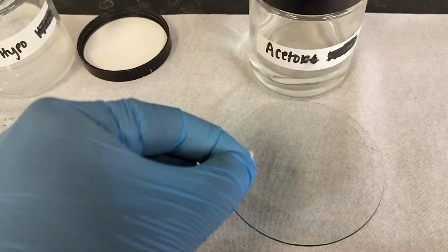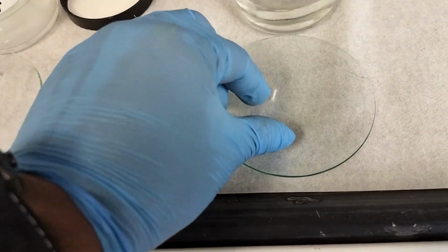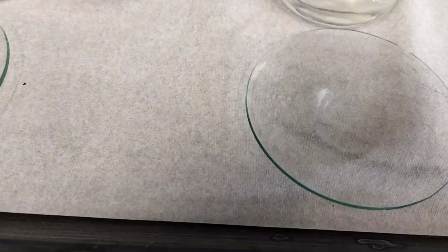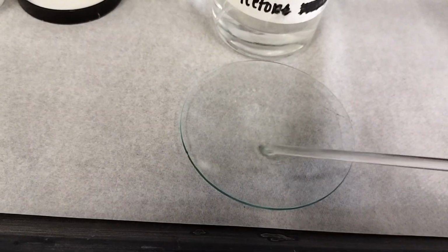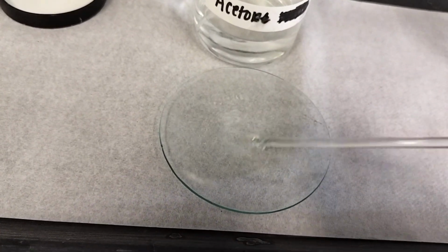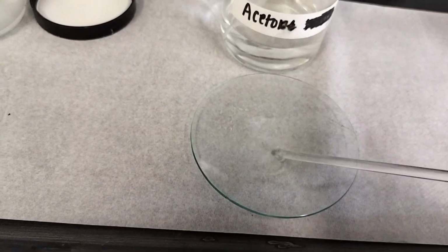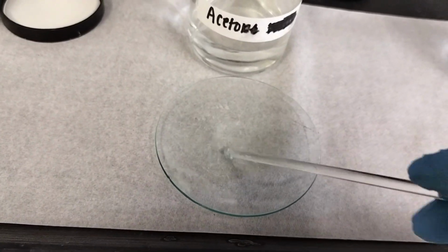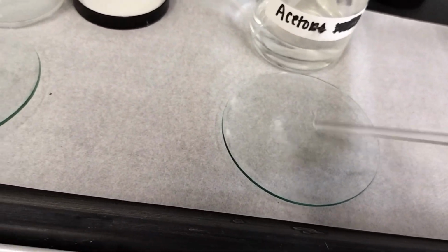This is an acetate fiber, and I'm now going to place this fiber sample into the acetone and observe the reaction. Let's see what happens when the fiber comes into contact with the chemical. Now I will gently stir the fiber in acetone and wait to see the results. So after a few seconds, the fiber has completely dissolved. So this confirms that the sample is an acetate fiber.